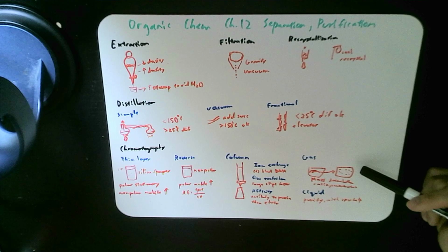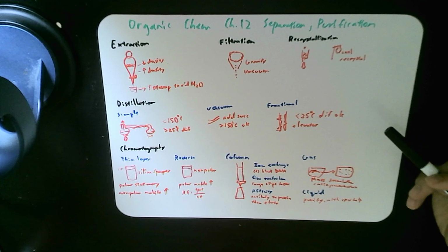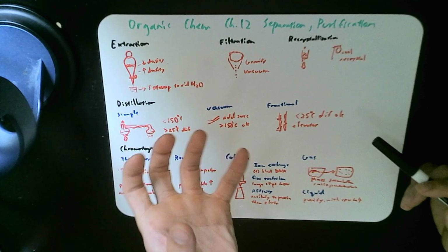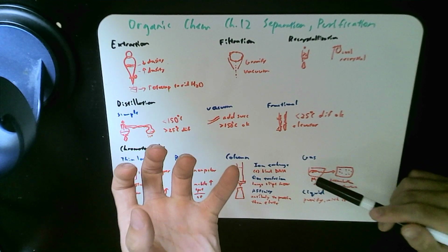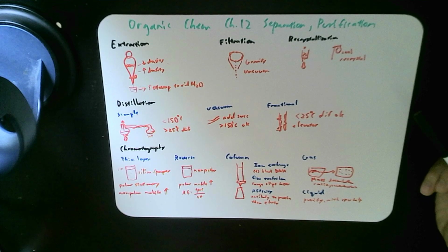In gas chromatography, you're heating up or using this gas as the solvent front, and whichever binds to the gas strongly, you can store it on a little chart, and you can determine the molar mass as well as the ratio and the concentration.